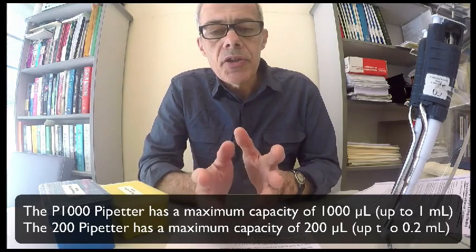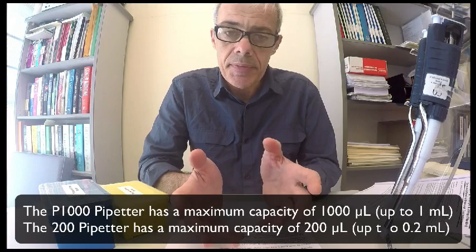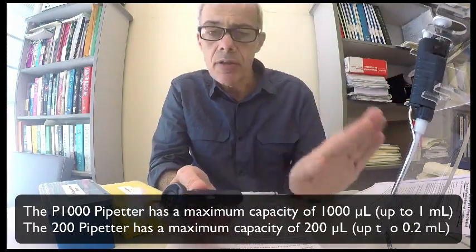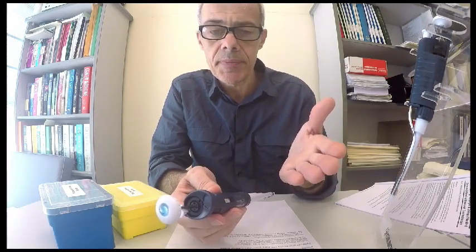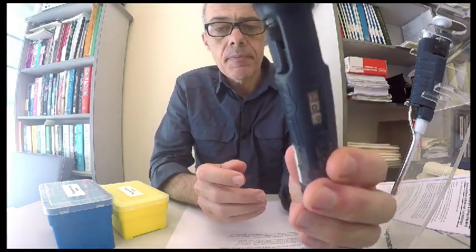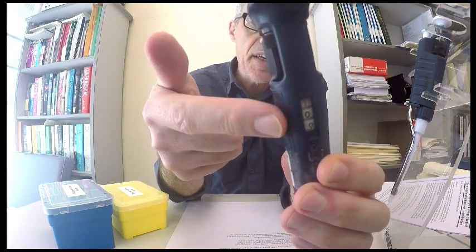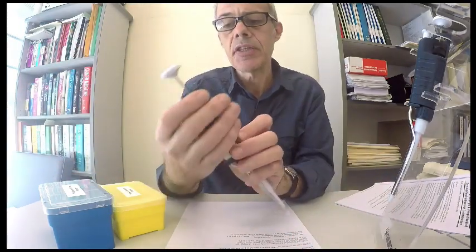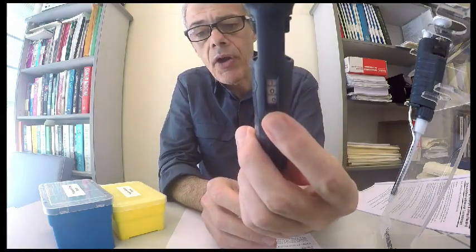So let's assume I want to dispense a volume of, say, 800 microliters. Clearly, I'm going to be using a P1000 because it's greater than 200 microliters and it's less than 1,000 microliters, so 800 microliters. There's a scale on these, and the scale here, at its maximum setting, is clearly going to represent 1,000 microliters. So this is set to 1,000 microliters, and the unit here is 100.